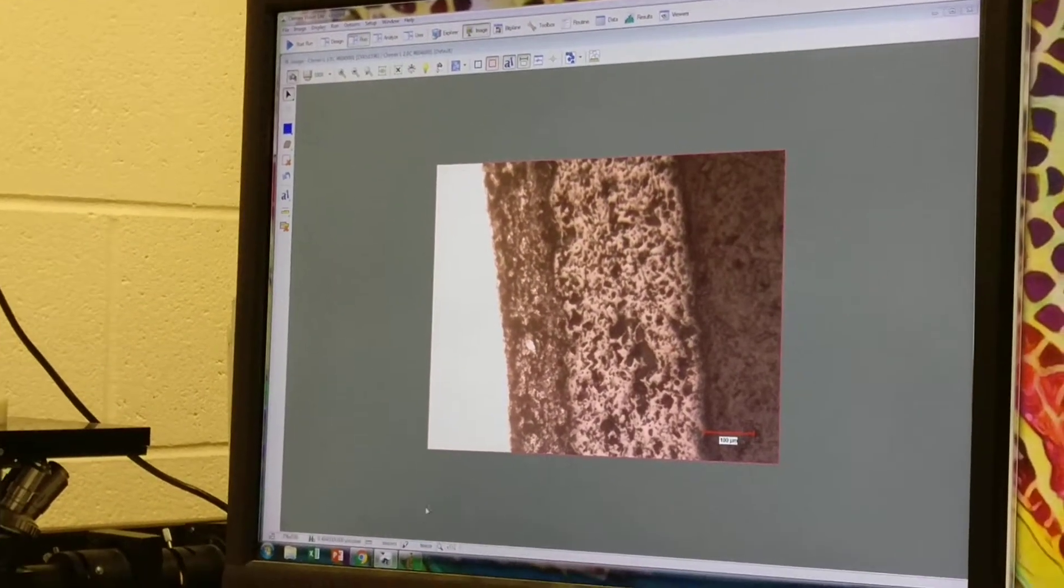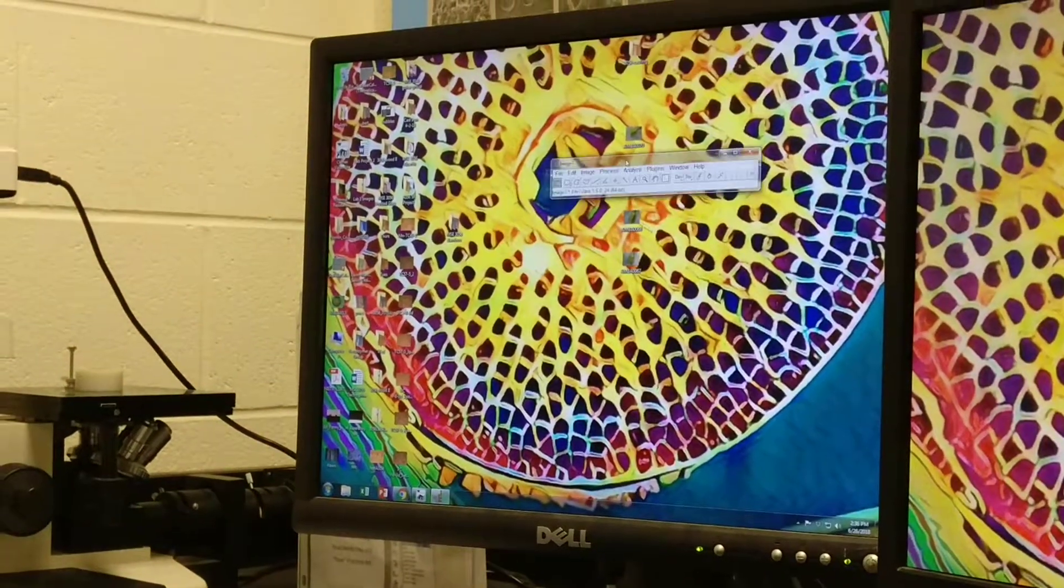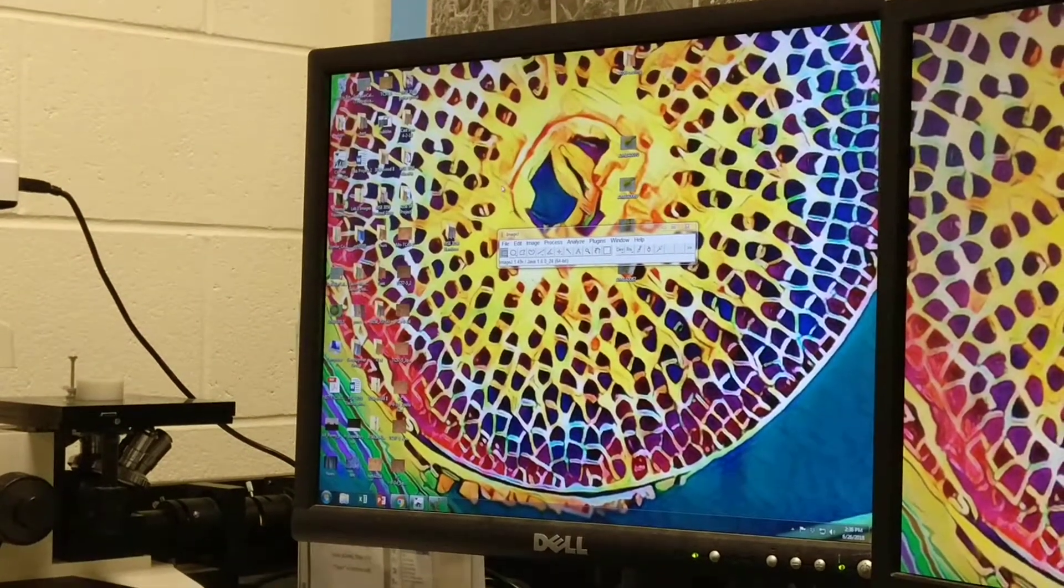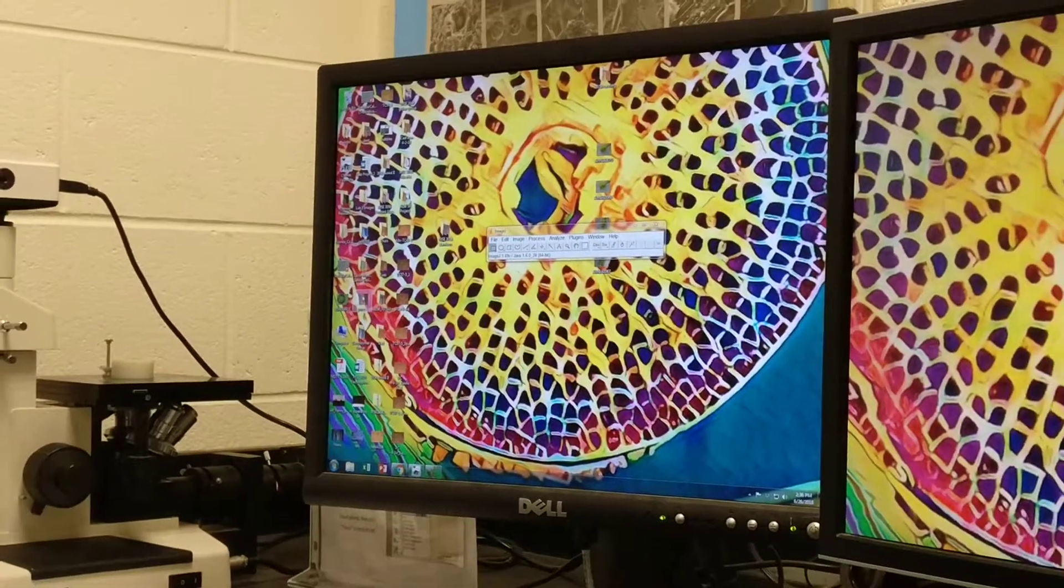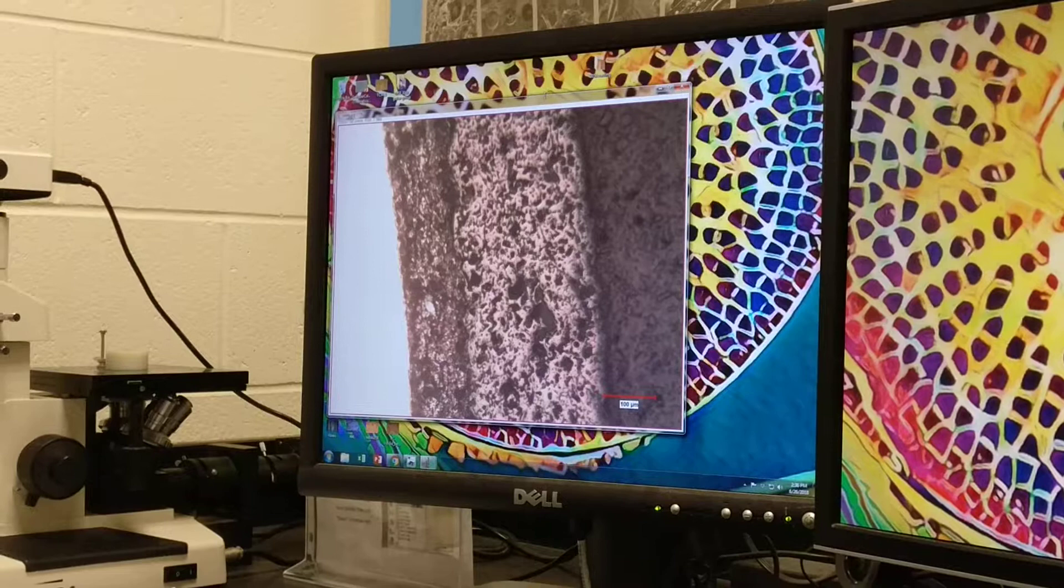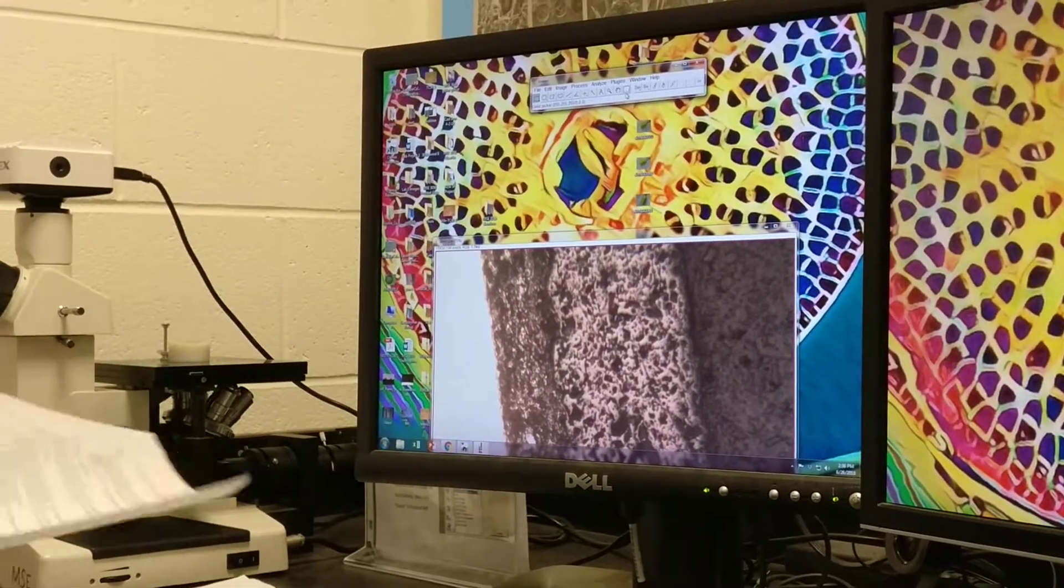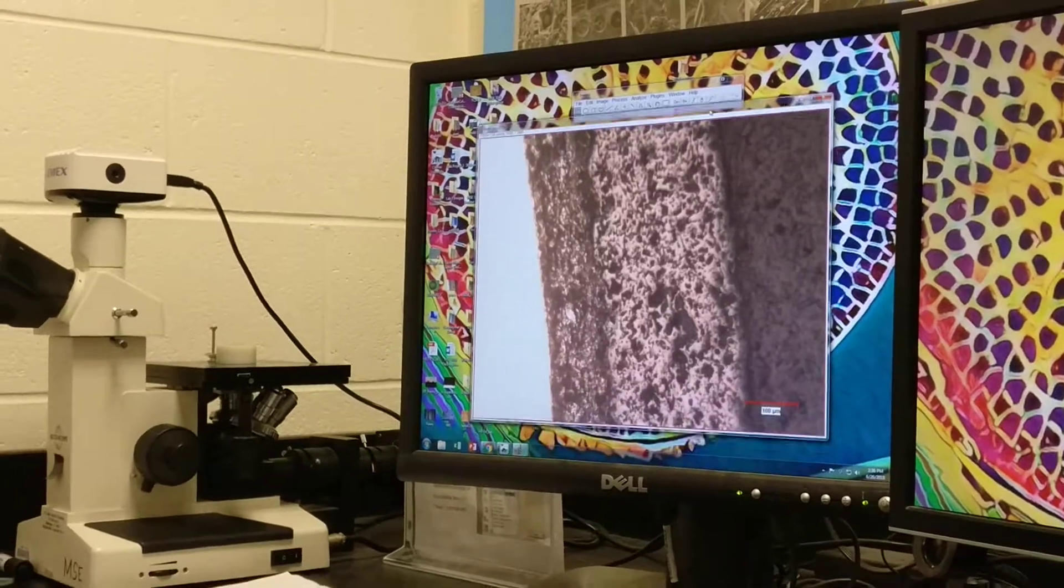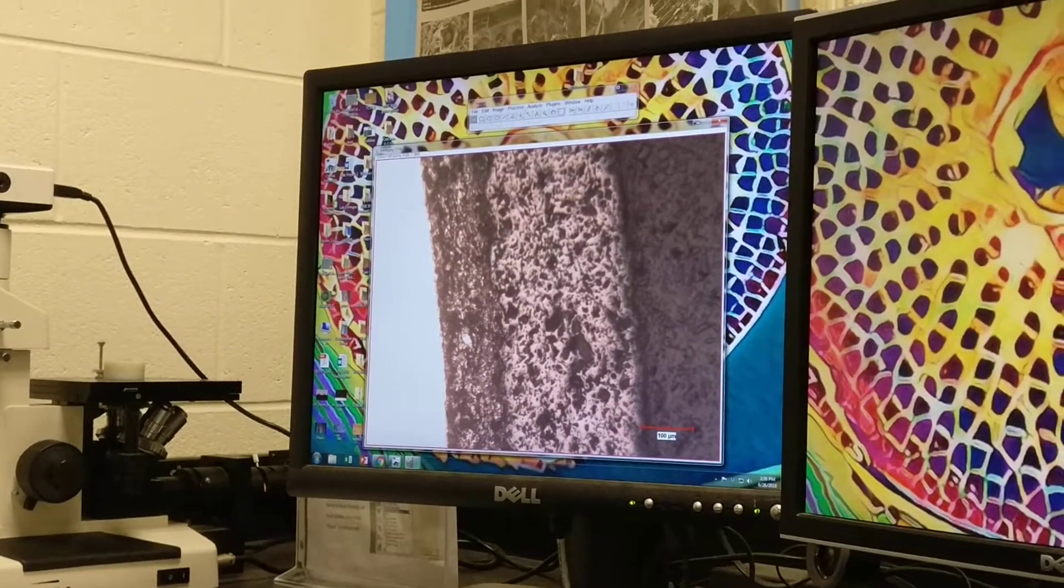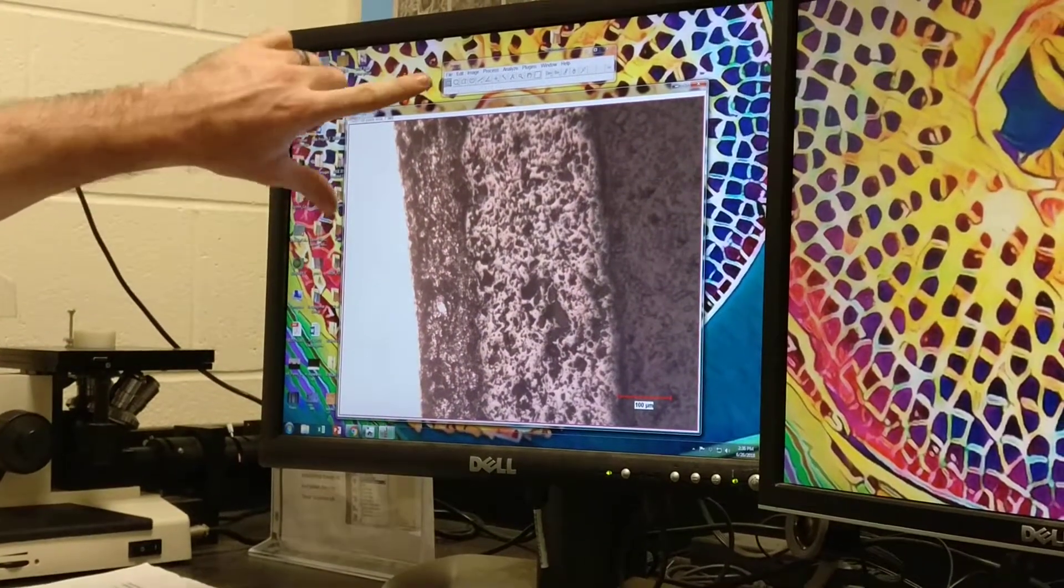The next thing we're going to do is open ImageJ software, which is this window here, and we're going to click and drag our image into that software. On the procedure page there's a list of things to do, but we're just going to do those in order.